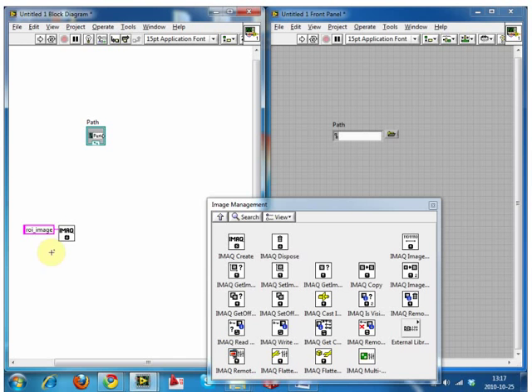The other thing we want to do for completeness is to tell it. Can you tell me basically what did you do here? You just gave it a name. But it still doesn't know that it will open this. We're not up to that point. All we're doing is IMAQ, it stands for Image Acquisition Buffer. We essentially now have created a tool which will make a space in the memory, and we've given it a name. We now need to give it a type.